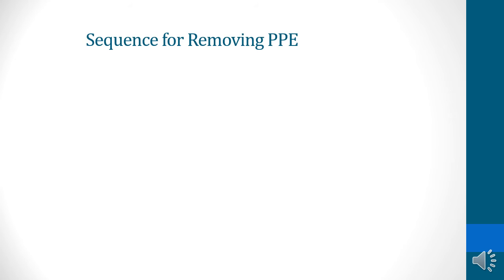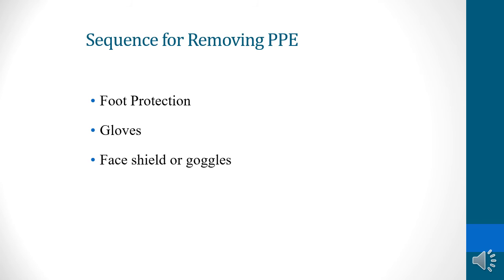A sequence for removing the PPE. We will remove first the foot protection, then the gloves, the face shield or goggles, the gown, and the mask or respirator.